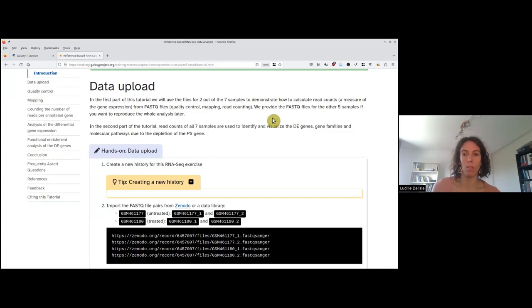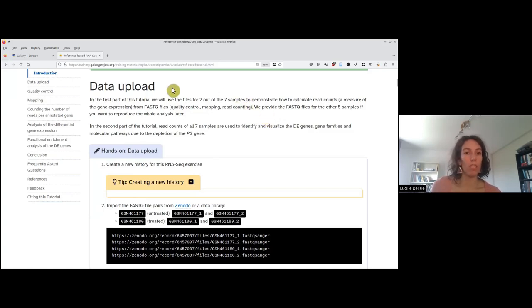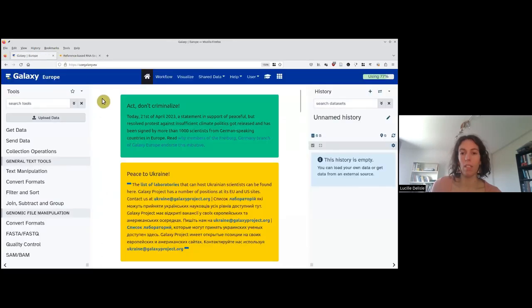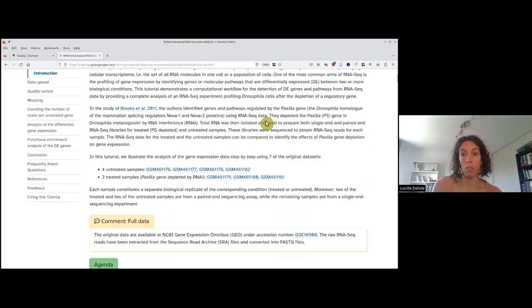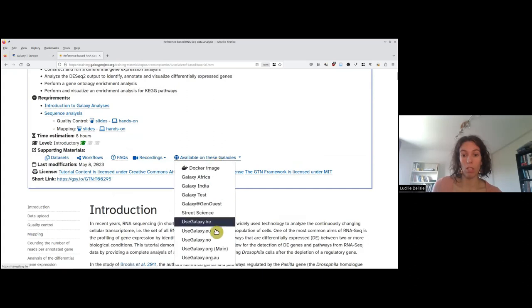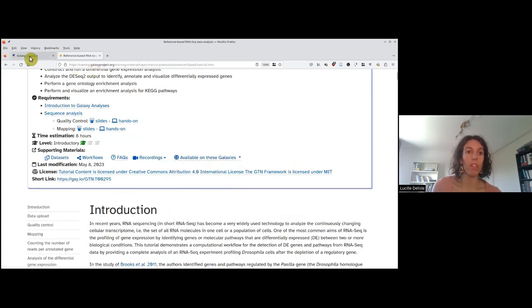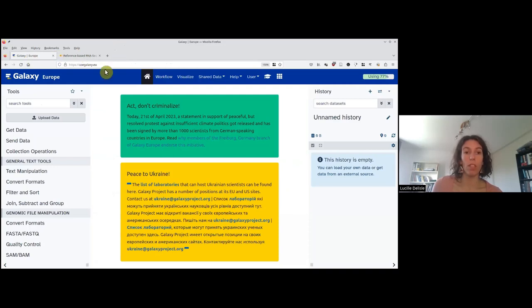For the two samples we will go through quality control, mapping, and counting the number of reads per annotated gene. So let's start. We need to go to a Galaxy instance. You can see the list of possible Galaxy instances that support this tutorial on the training material. I show you today on usegalaxy.eu, but you can choose the one you want.